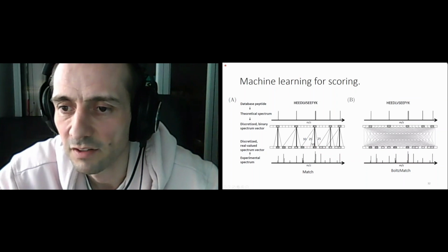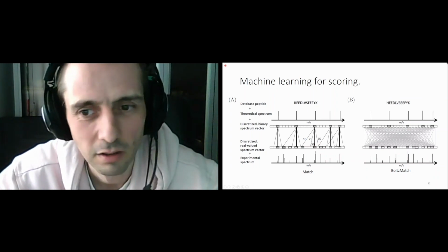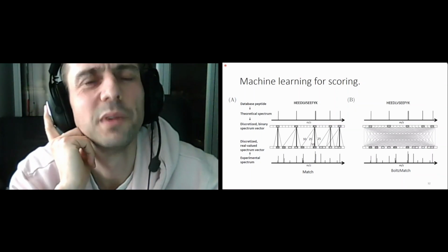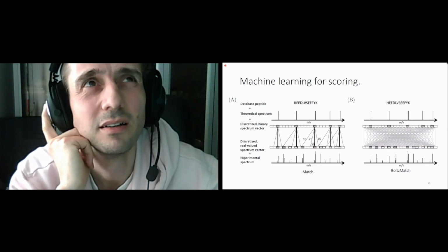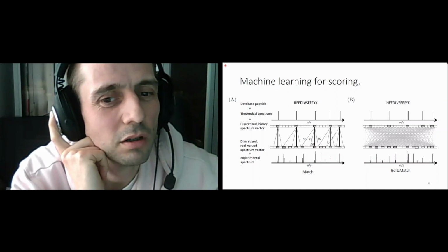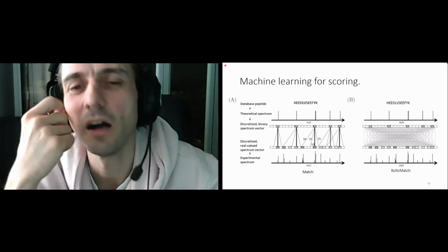this experimental spectrum. Okay. So in the old method, 4 weights were manually calibrated, right? 10, 25, 25, and 50. Yeah, they did it manually. Yeah, so just 4 weights were calibrated, right? Just 4 weights were chosen, or how many weights were manually calibrated?